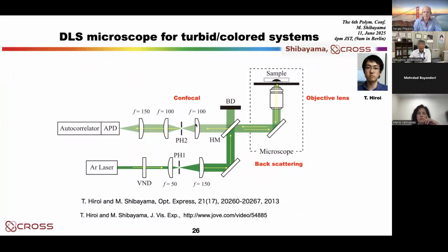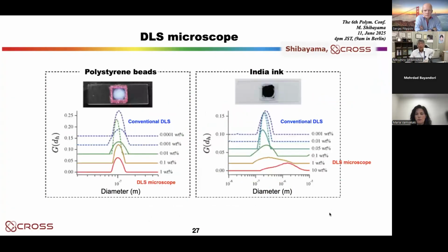So with this confocal setup, we can change the depth of the samples. And those are published in this paper, or also the Journal of Visualized Experiments. You can visit this one as well. So let me show the result.